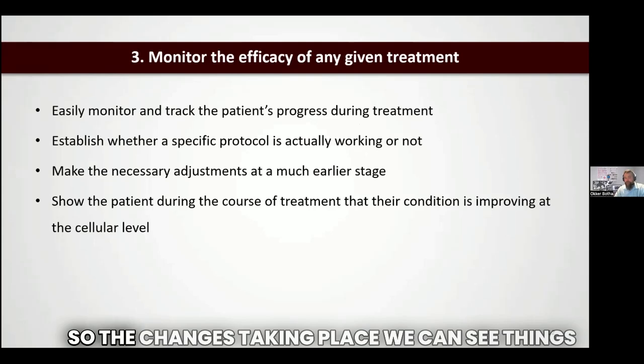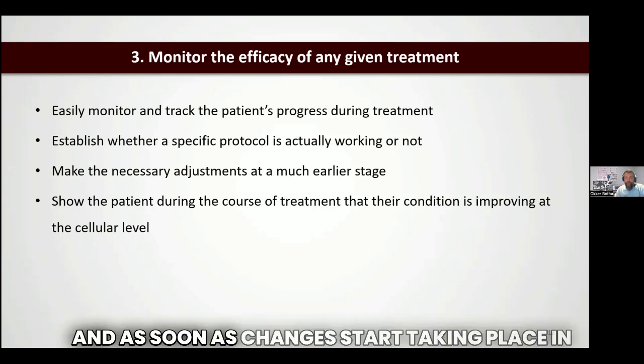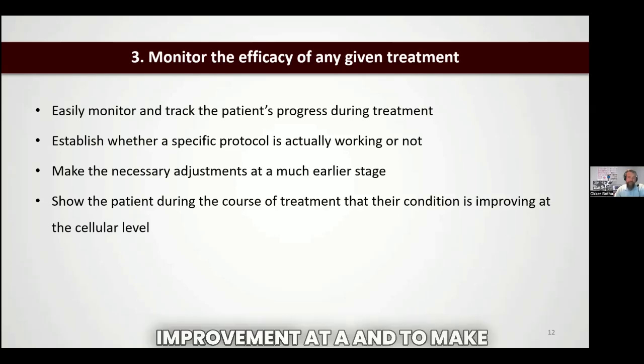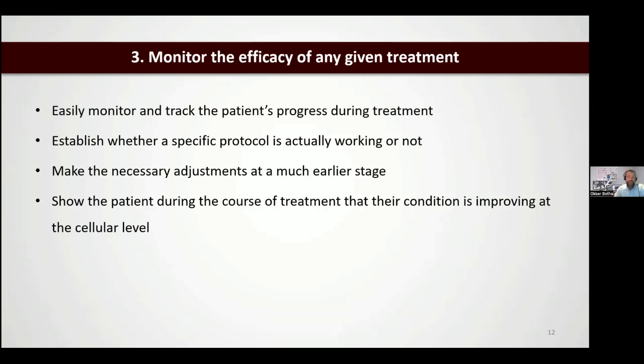So the changes taking place, we can see things going on in real time in the samples. And as soon as changes start taking place in the terrain, we start seeing changes in the blood samples as well. So very useful for us to monitor for improvement and to make changes to the protocol where necessary, at an earlier stage.